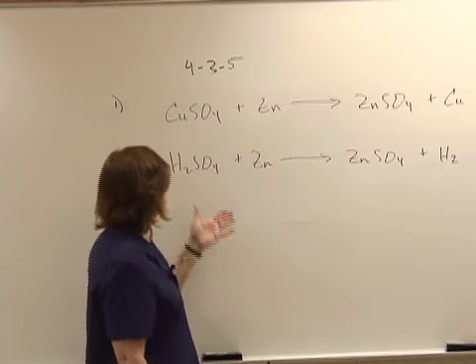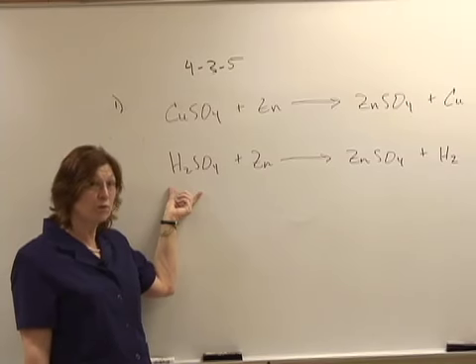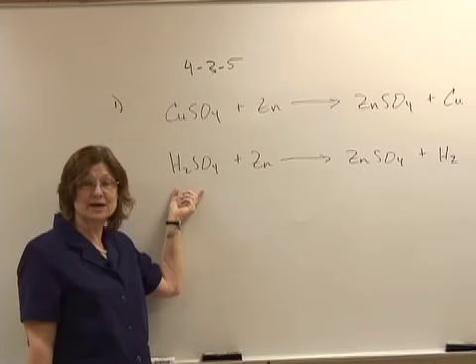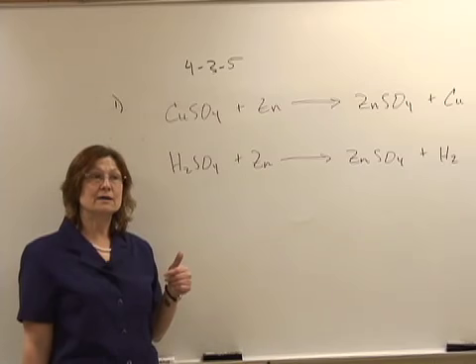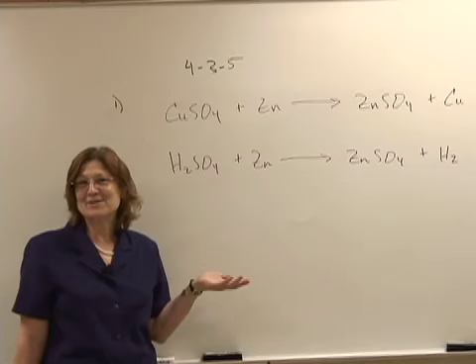That gas came from the excess sulfuric acid in the reaction before, when we added the sulfuric acid to the copper 2 hydroxide. And we discussed that when we did the warm-up number 2 the other day, and I'm sure you can go back and find which one it was.